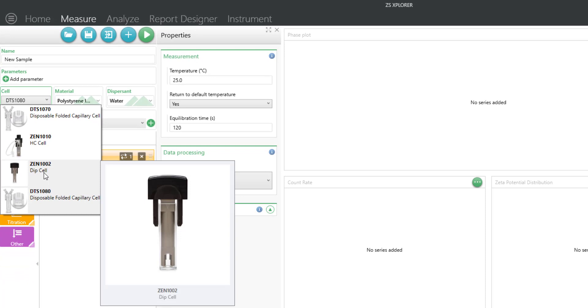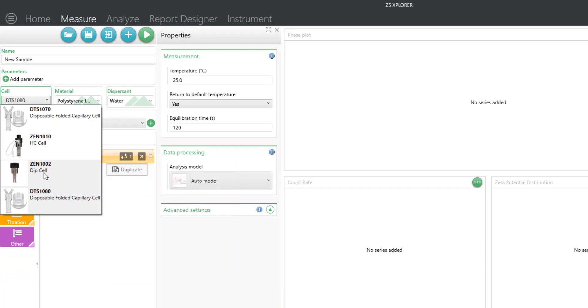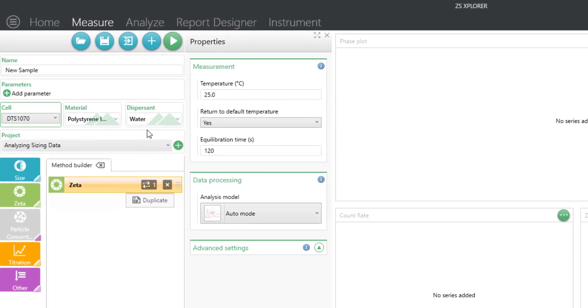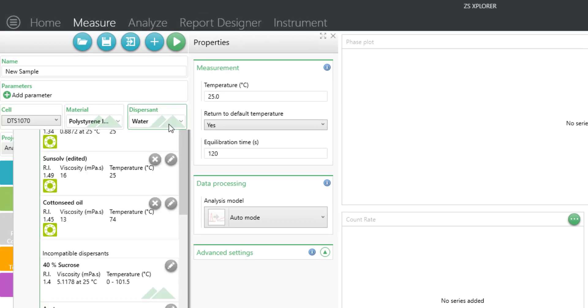There are other cells such as the dip cell that can be used if you're working with organic solvents or oils.